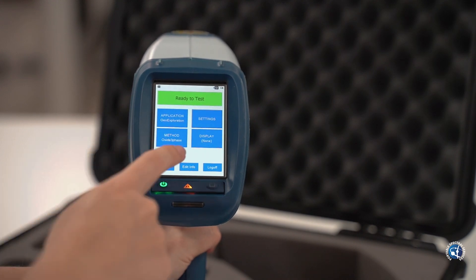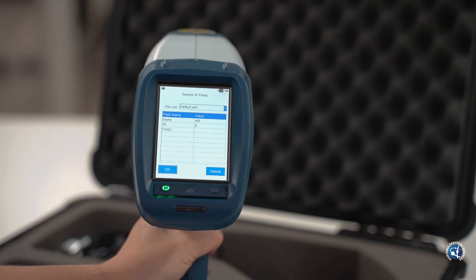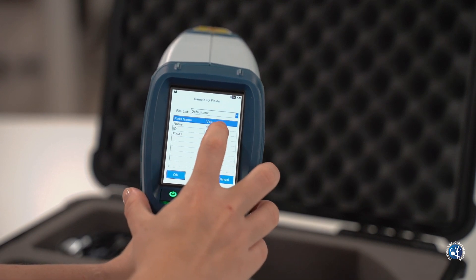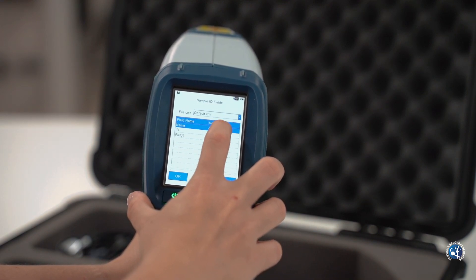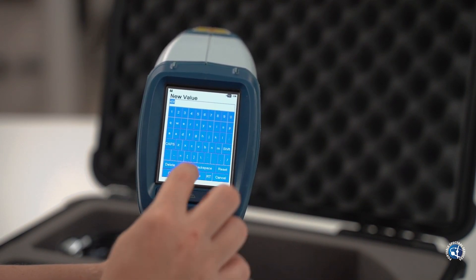To name your samples from the home screen, click edit info, double click on the white box in the value column and enter in the desired name using the keyboard. Click OK and you're ready to go.